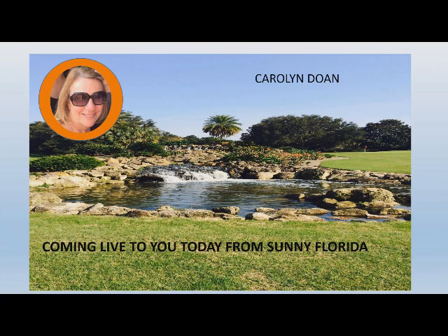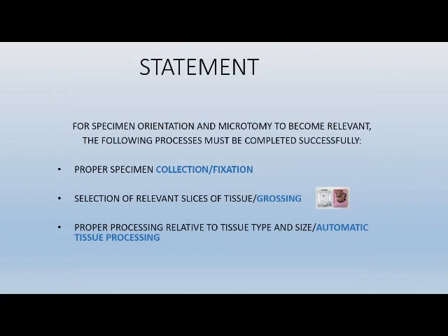With that said, I also want to let you know I do not consider myself an expert. I am simply relaying some information that I got from these several different ways. I'm going to make a statement first, though. For specimen orientation and microtomy to even become relevant, there are some processes that must be completed successfully, or we don't even get to that middle stage of the cycle of histology.